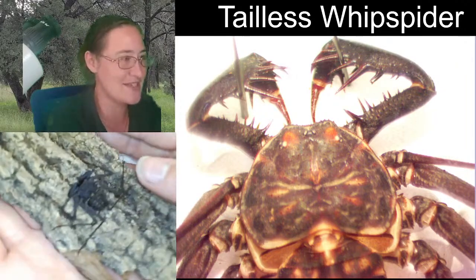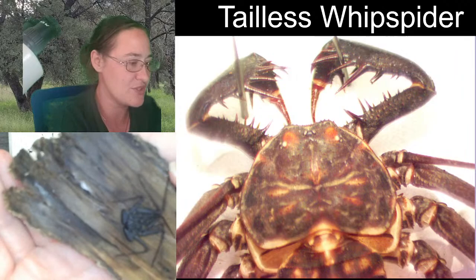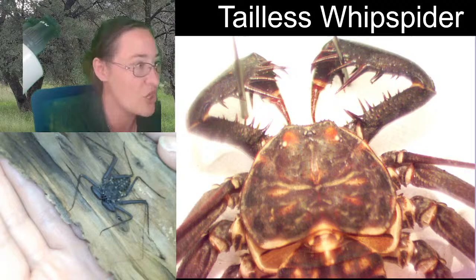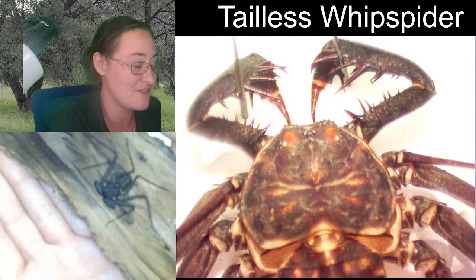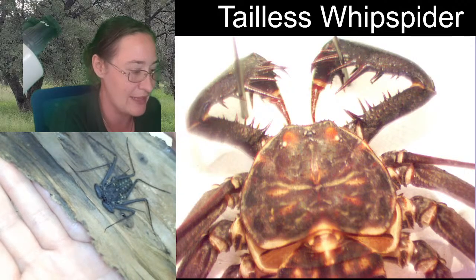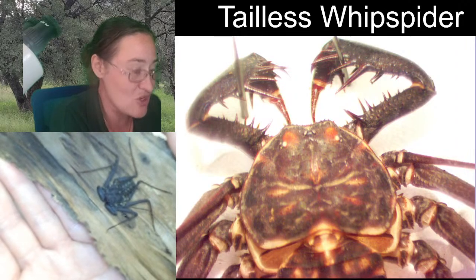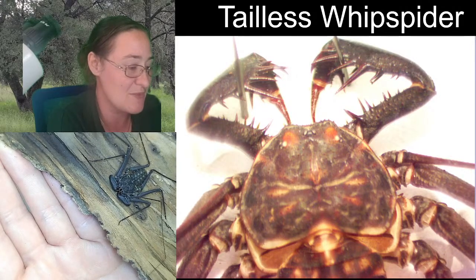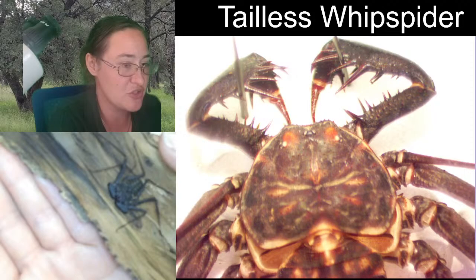This is the live spider, and you'll see it moves very, very fast. It's one of those arthropods I love to share with kids, but it is not something I would let a student hold, because these specimens have definitely ended up on my back before. You can see it's using those really long whip-like legs — we actually call them antenna-form legs, because arachnids don't get antennae. With the very little eyesight that they have, they need something to help them know where they're going, so they use these really long legs to reach around and check where they're going.